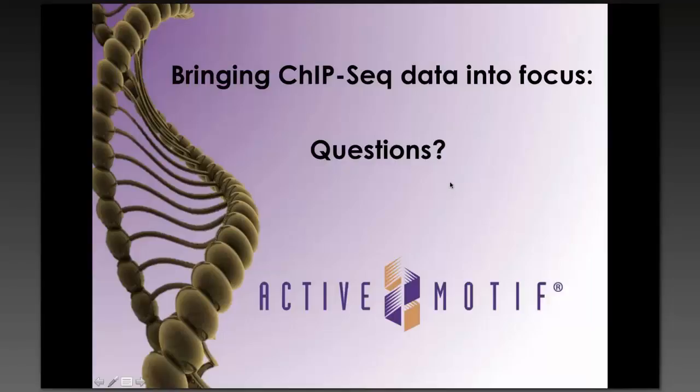But as the person suggested, you can also maybe increase the amount of sequencing you're doing to compensate for that. But those numbers can get skewed when you start looking at other things like transcription factors or less prevalent histone modifications. But for the experiments we presented here, it's somewhere between 500,000 and 5 million.